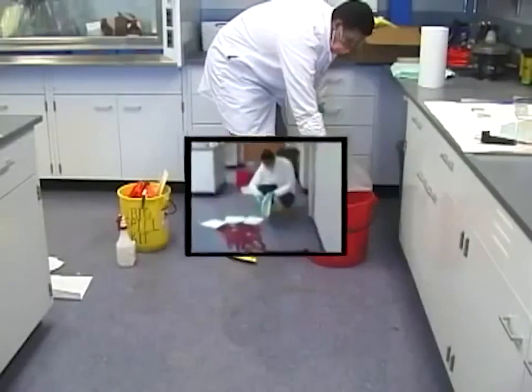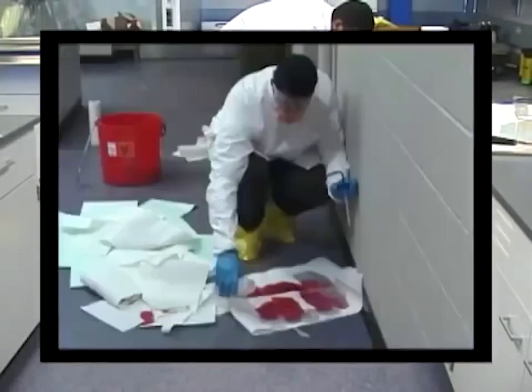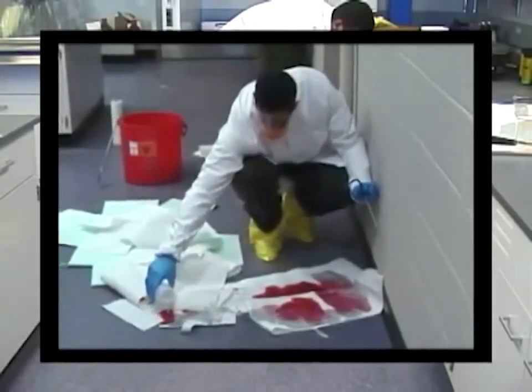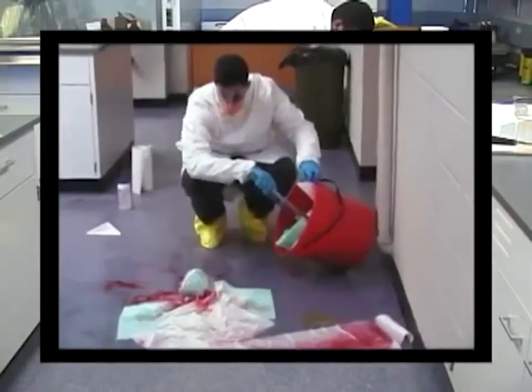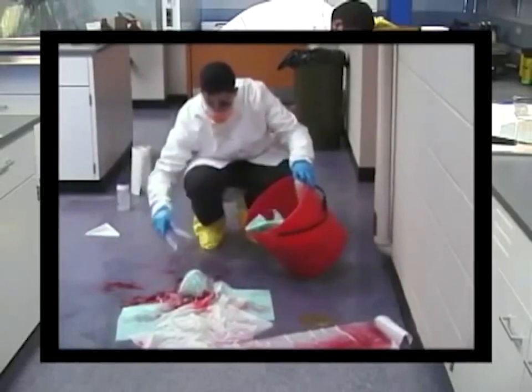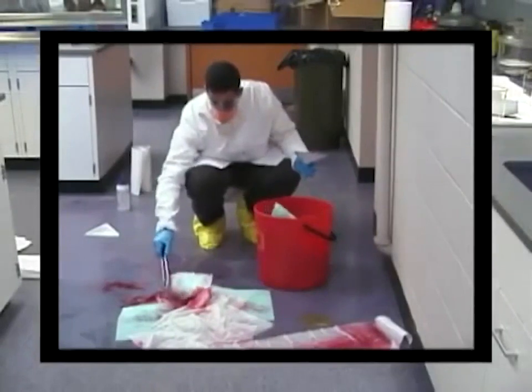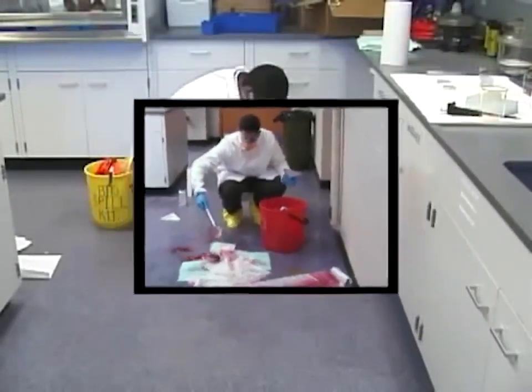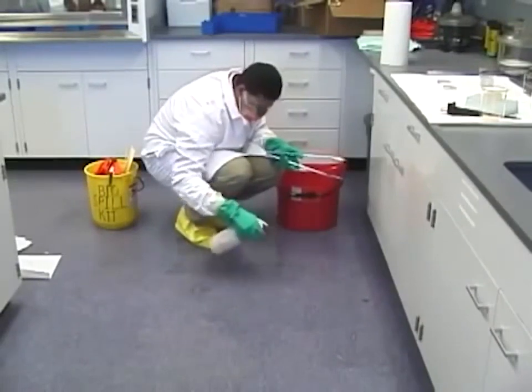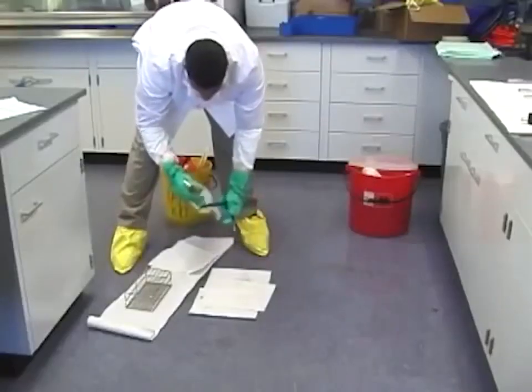Please note, if this was a high-risk blood spill or a spill of an infectious agent, the absorbent material would have been placed over the sharps, the disinfectant added, and the sharps, together with the absorbent material, disposed of in a sharps container. This procedure decreases the risk of handling sharps prior to disinfection. Once the area has been cleaned of all visible contamination, spray the area with disinfectant and allow it to air dry.